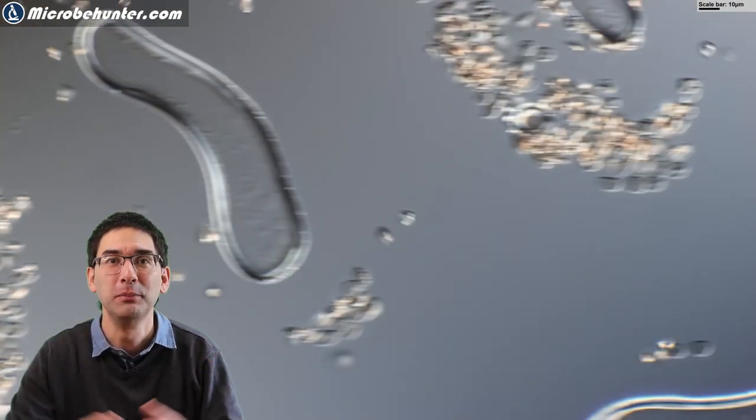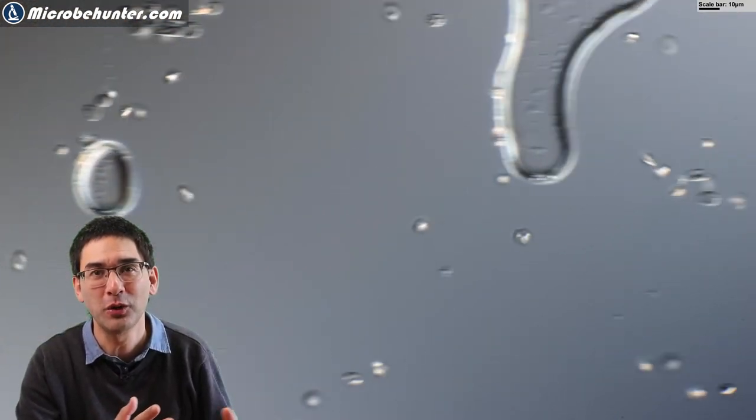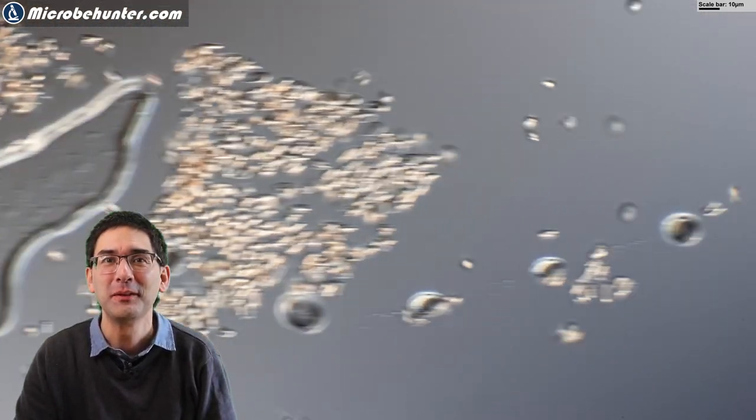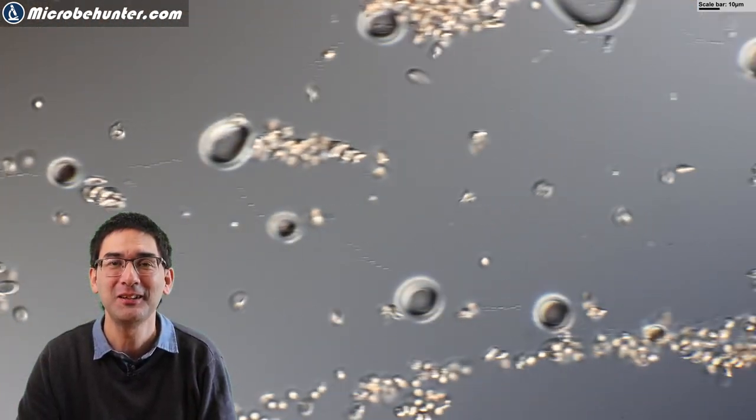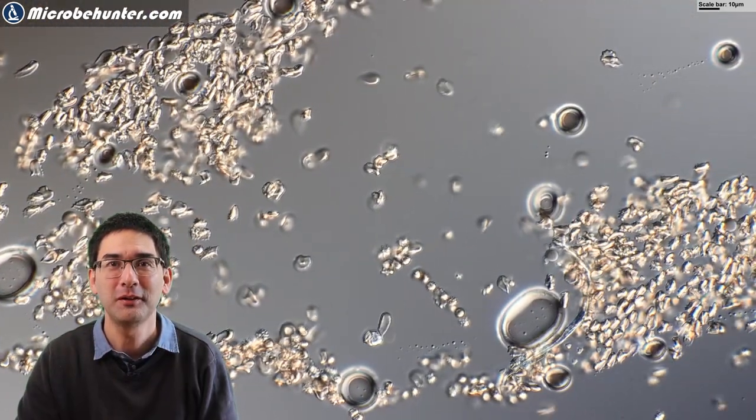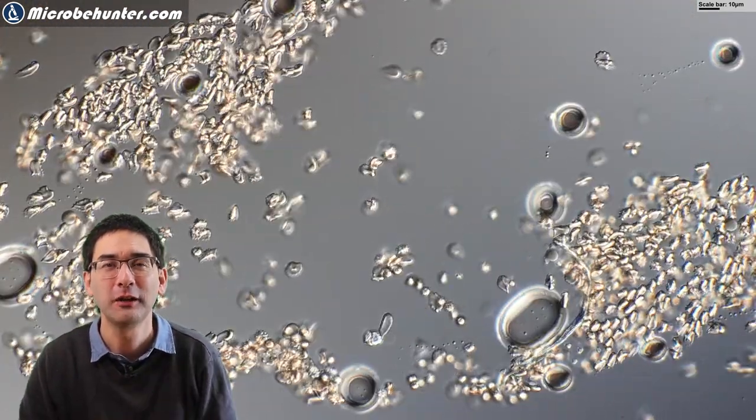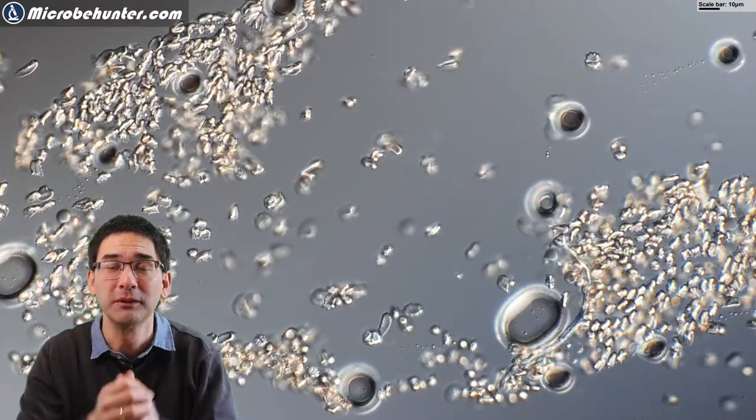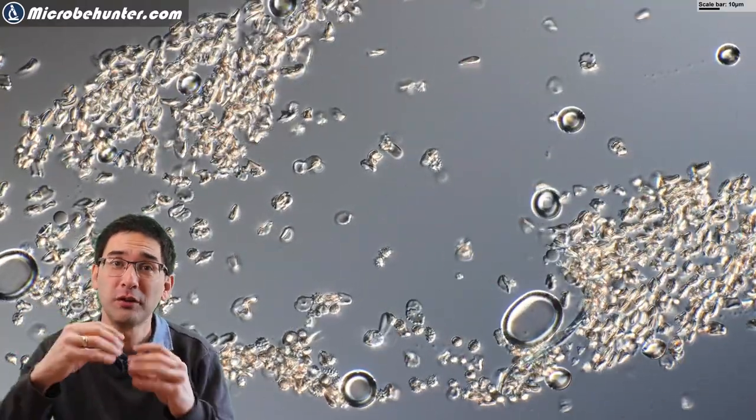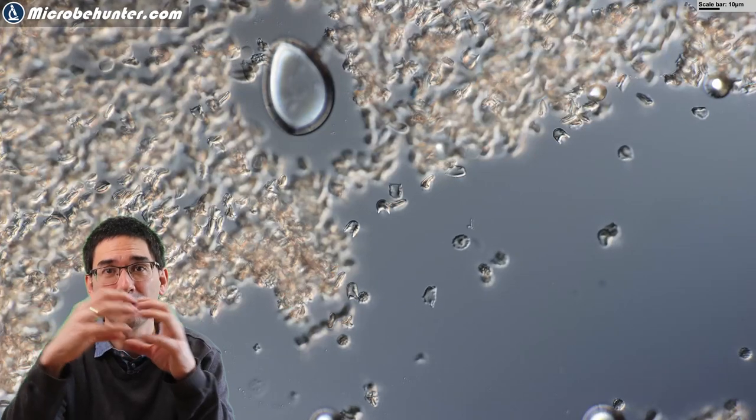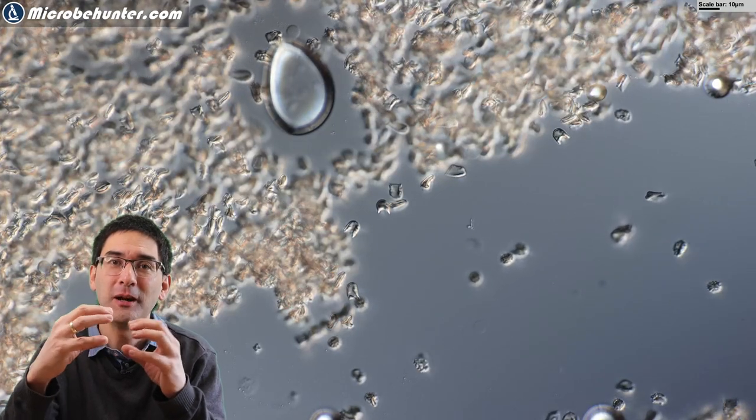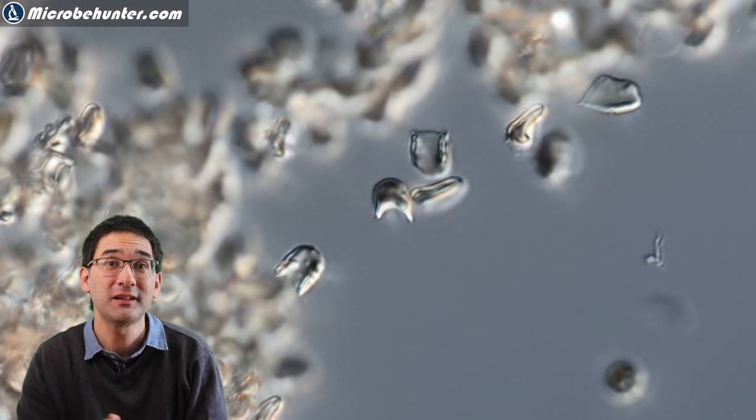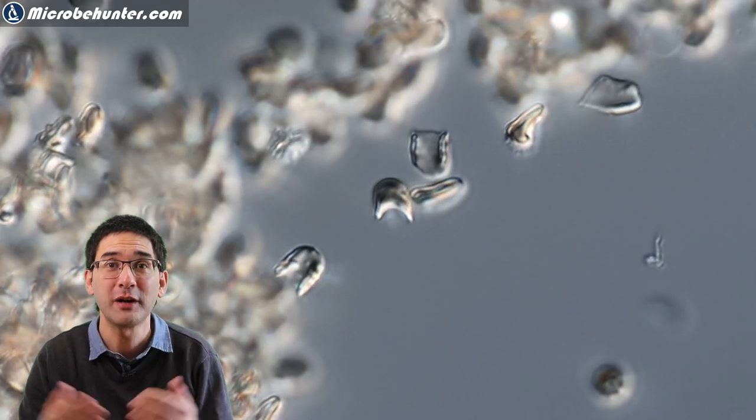This is when the salt water was able to do its action. By osmosis, the blood cells started to lose water. As the water streamed across, I was trying to follow along some of those red blood cells. The movement was so quick that I was not able to see the change in shape. But then I stopped the microscope slide and looked carefully. Gone is the nice round shape. The cells are much smaller right now. They're kind of shriveled up and quite irregular because there are wrinkles as the central part of the cell started to shrink and the water was all removed. This means that the cells are not able to transport oxygen anymore.